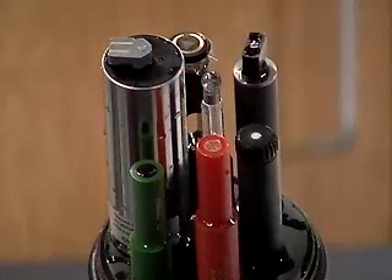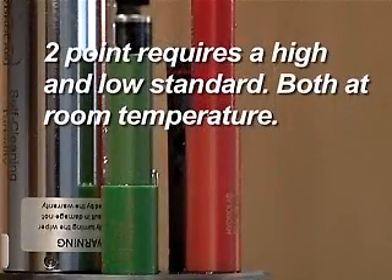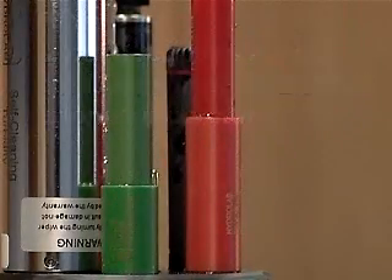Determine whether you will be performing two-, three-, or four-point calibration. A two-point calibration requires a high and low standard, both at room temperature.